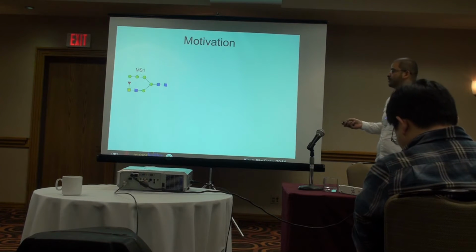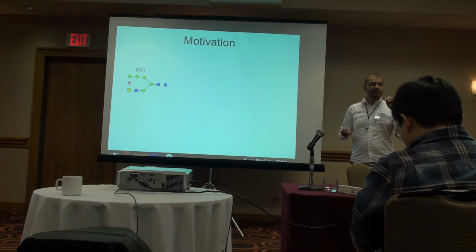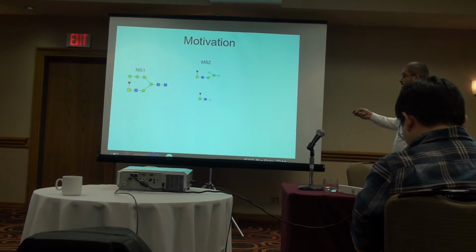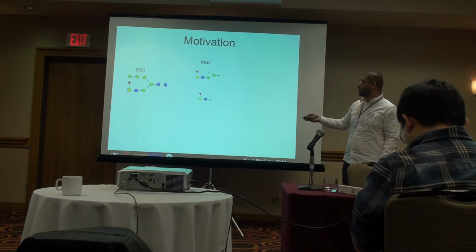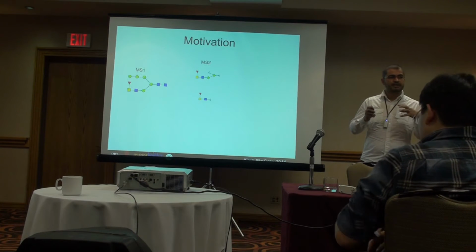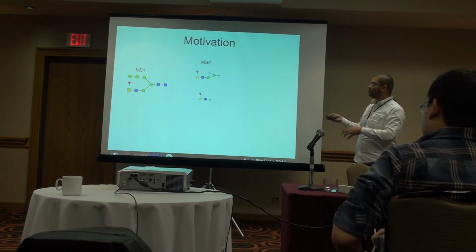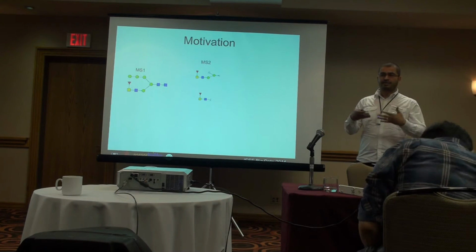So what is important is to recognize the glycan structures in biological samples. What they need to do is grab a biological sample, then send it to a device called a mass spectrometer. The mass spectrometer breaks the glycan structure inside the biological sample into pieces called fragments. And this level where the glycan structure exists by itself is called MS1, so usually they cannot recognize which glycan is present in the biological sample by just taking the MS1. It's very difficult because sometimes they'll have hundreds or thousands of glycan structures together.